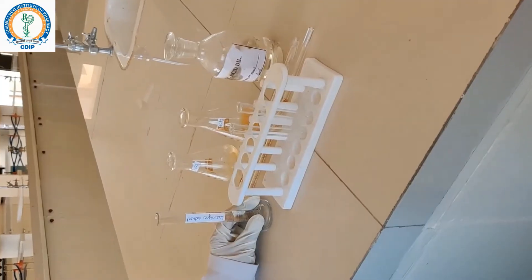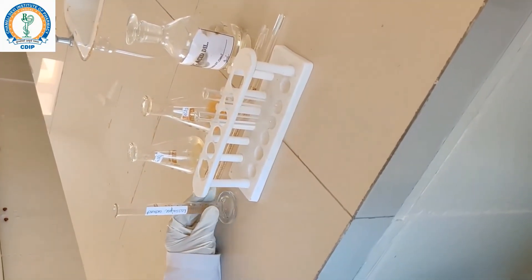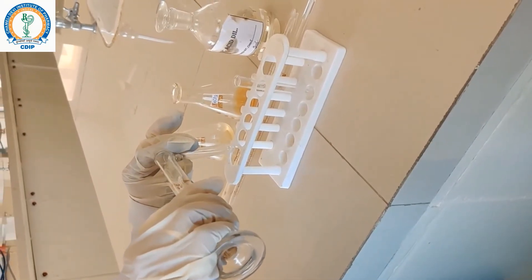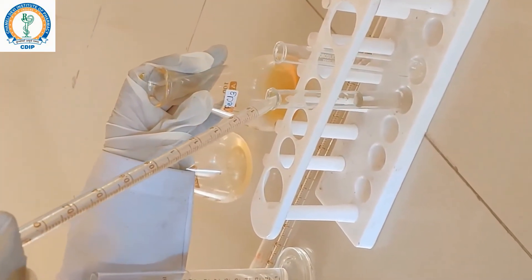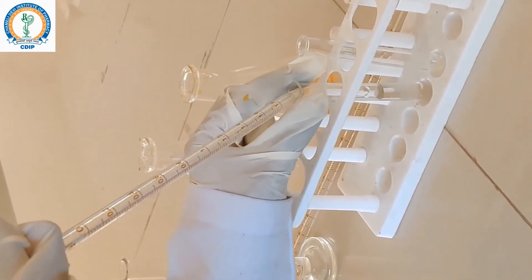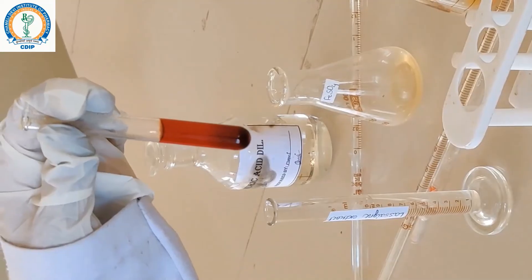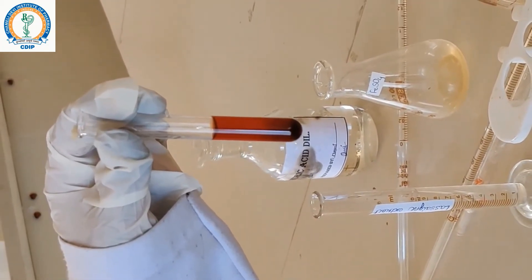If the amount of sodium is too less in the Lassaigne extract, we will perform the ferric chloride test for the detection of sulphur and nitrogen. Transfer a small portion of this Lassaigne extract into a test tube and add a few drops of ferric chloride. The colour change to blood-red colour indicates the presence of sulphur; this is due to the formation of sodium thiocyanate in this test tube.